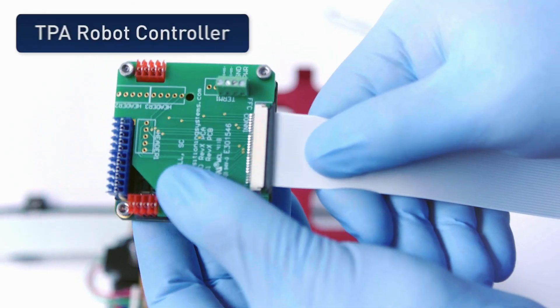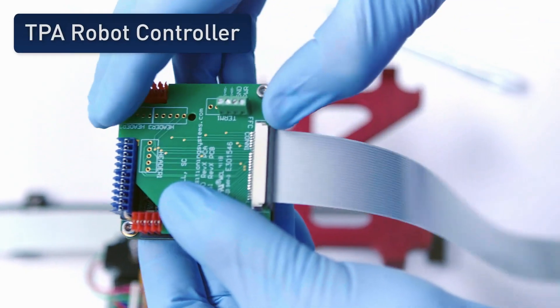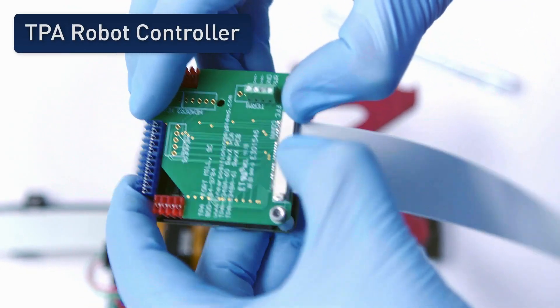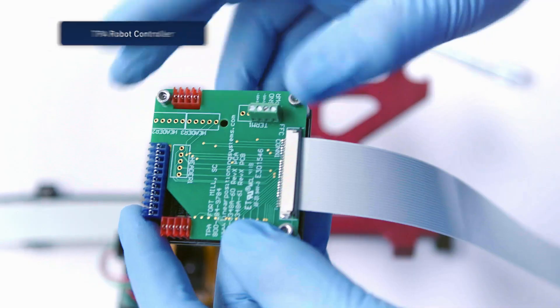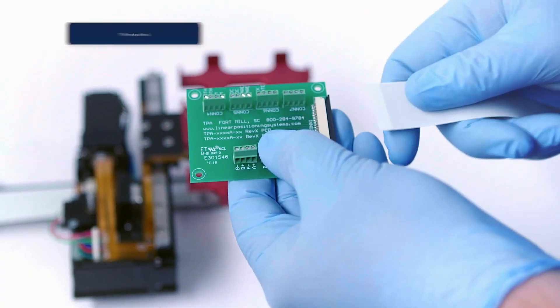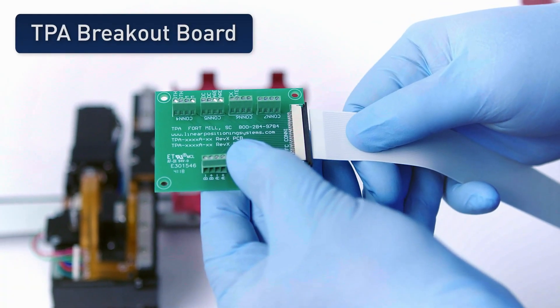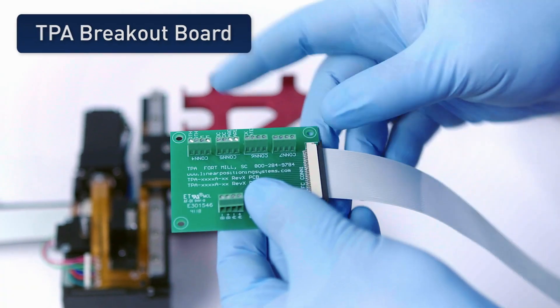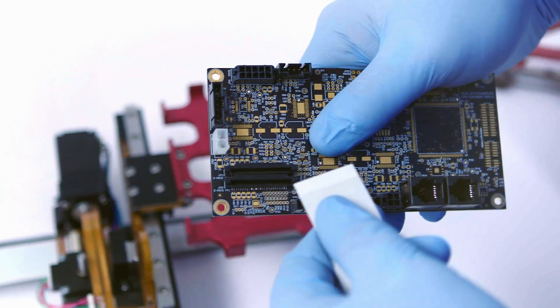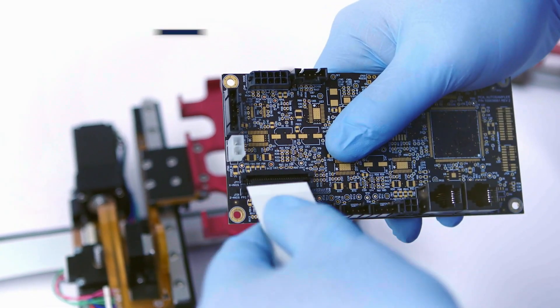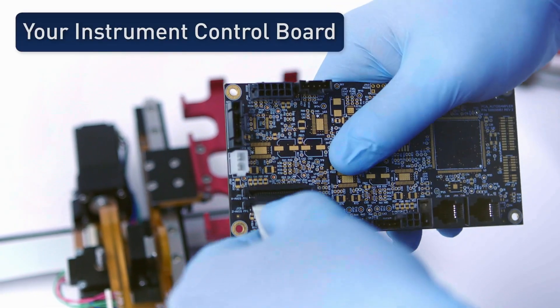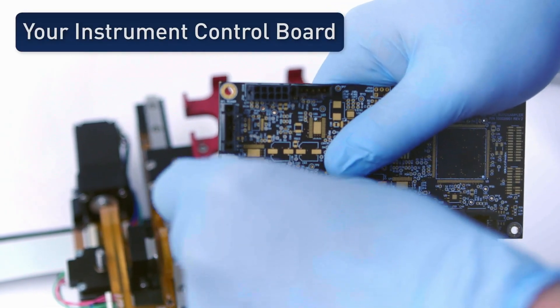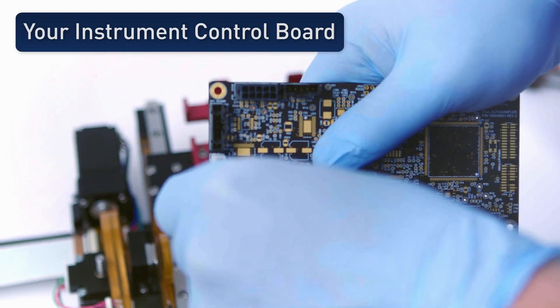That single FFC can plug directly into TPA's mini robot controller or connect into a breakout board for easy wiring into an off-the-shelf controller or connect directly into an instrument control board that you design yourself.